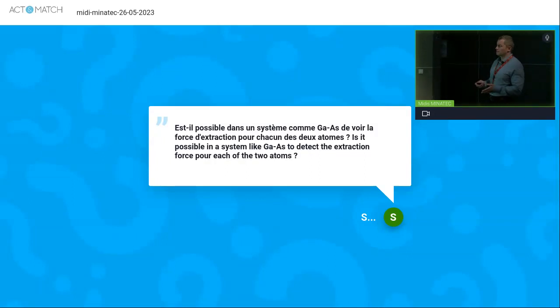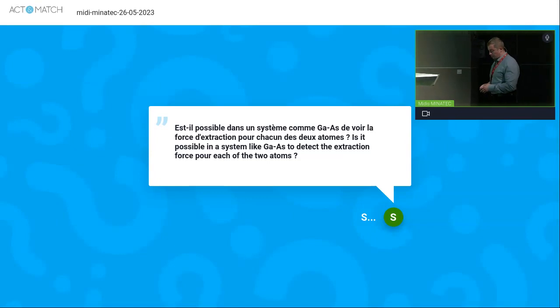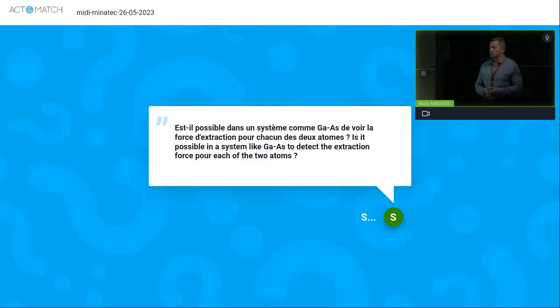There are some publications, but a very low number, and it's rather difficult to have atomic resolution with electrical characterization. I showed just one example with topography, which is already very difficult. But for electrical characterization, we will have resolutions which are on the order of the tip apex, so for example 5, 10 nanometers, etc. So we will not have access to the single atom.